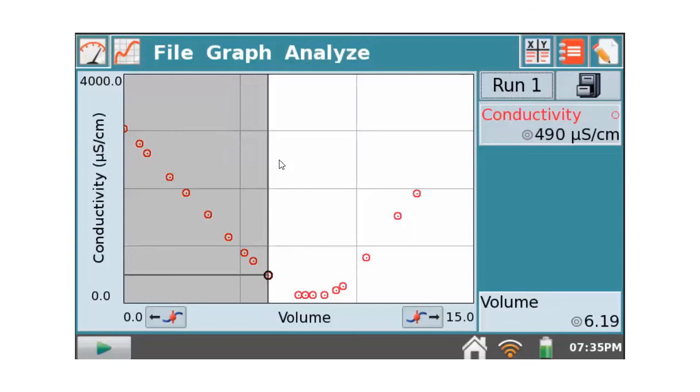That will be your endpoint. That's the volume of sulfuric acid required. Now you're going to do this two ways. Once you find that volume, we can use the standardized concentration of sulfuric acid to work back through our acid-base relationships and find out how many moles of barium hydroxide you delivered and therefore its concentration.